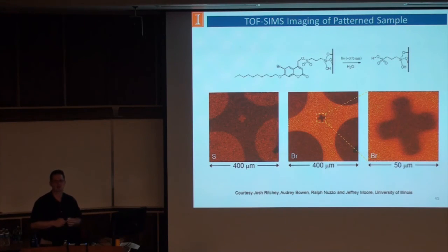And the first molecule that they brought to me was just all carbon and hydrogen. There was no difference. So then they brought something that was just covered with fluorine, and it worked perfectly. And so he goes, but that doesn't help me. That's not a useful molecule. And so he said, what if I put a bromine on this? And so that's what he did, and we were able to get some good results.